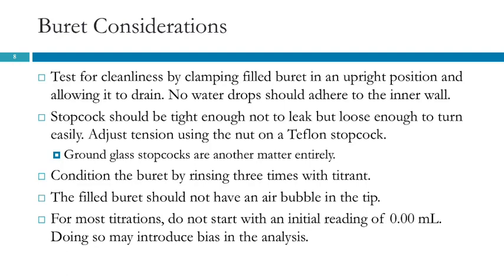So there are ways to clean a burette. You do not generally use a brush on the inside of a burette because we don't want to scratch it at all. There are a variety of different cleaning solutions that can be used that'll basically just dissolve off anything that's in there, and those are typically not safe sorts of solutions, and so we let the lab techs do that instead of letting the students do that.